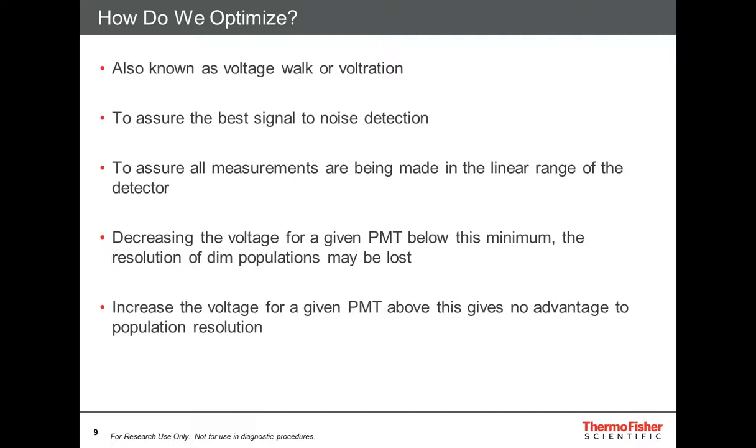We knew that most of our fluorochromes, most of our samples would fit in that space, and maybe sometimes we had to turn the voltage down, but otherwise we got pretty good data. Then we started using analog to digital hybrid machines and then fully digital instruments. And we saw all sorts of things happening. We saw that if we crank the voltage up, there were populations appearing that we didn't see before. And we saw our background increase sometimes. We saw all sorts of things.